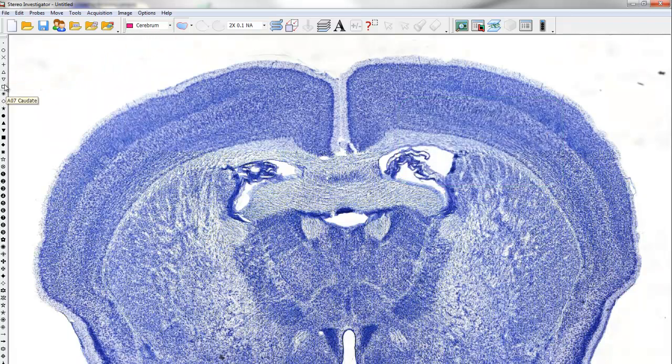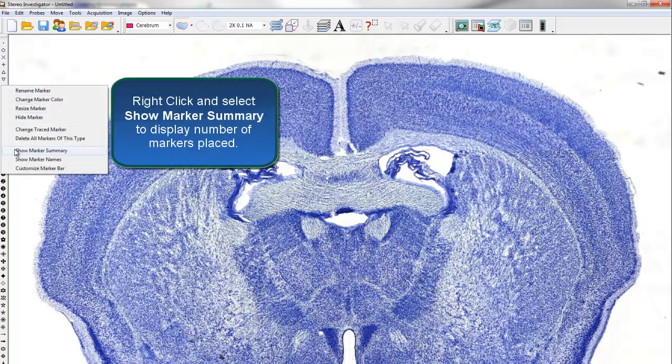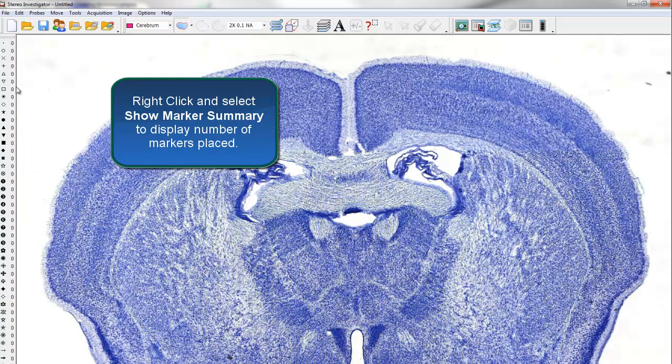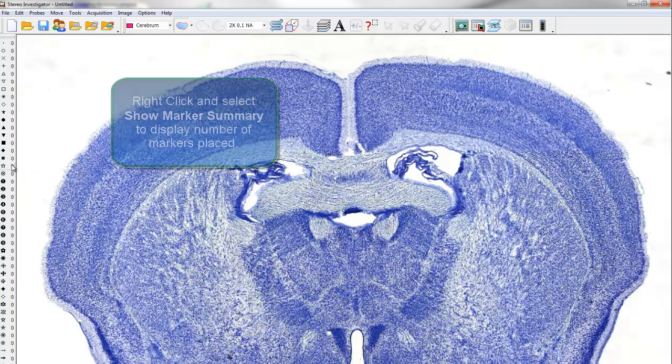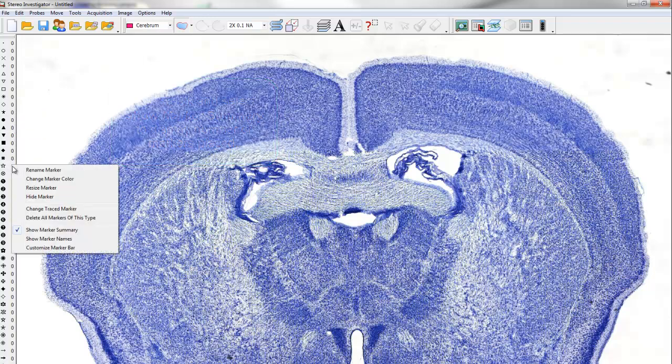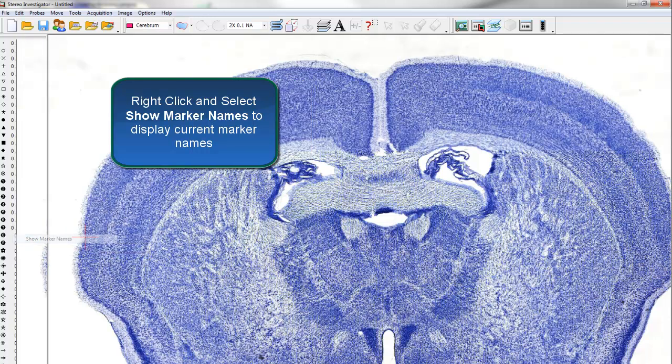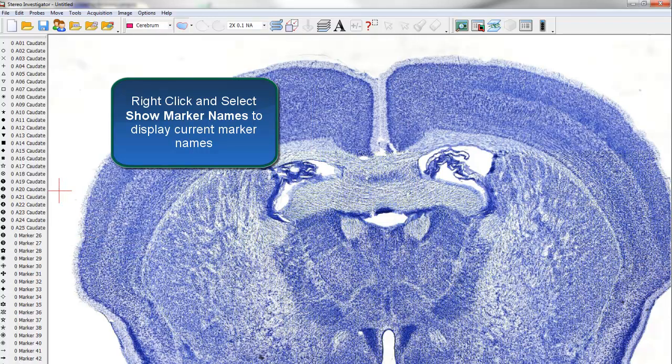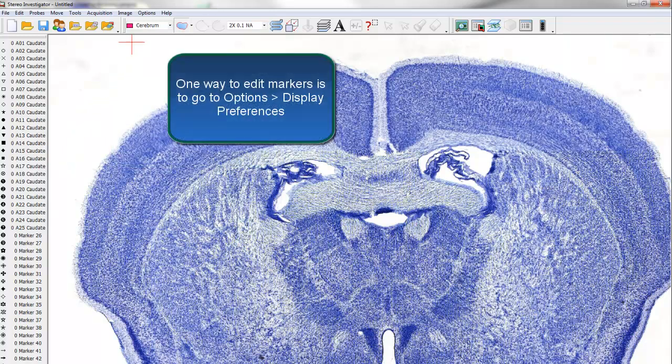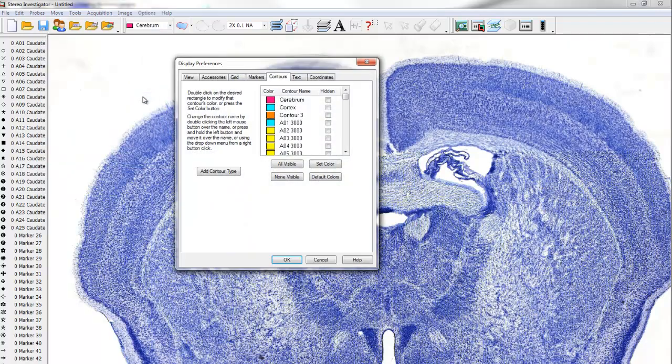Markers are displayed in the Marker Toolbar here at the left-hand side of the screen. Right-click and select Show Marker Summary to display the number of markers placed. Right-click and select Show Marker Names to display the current marker names. One way to edit markers is to go to Options Display Preferences.